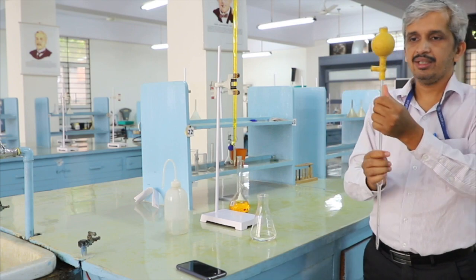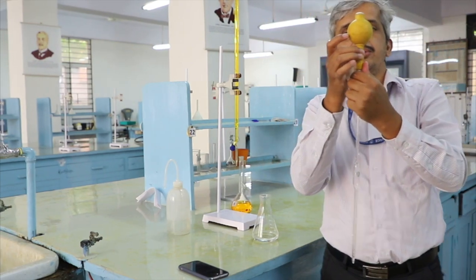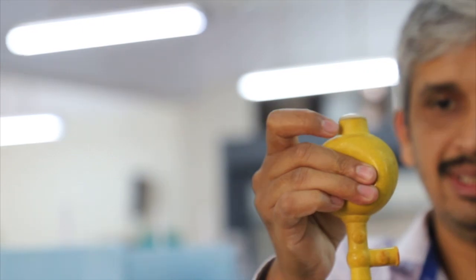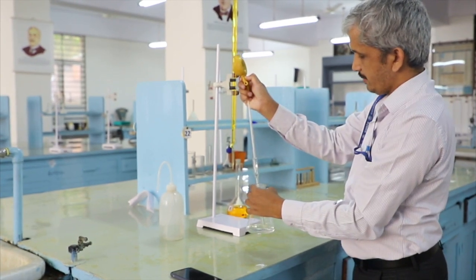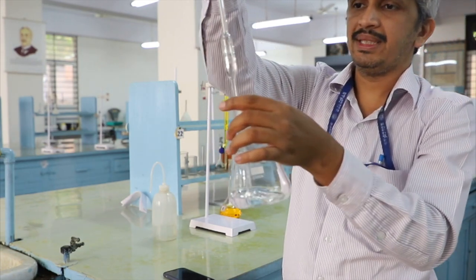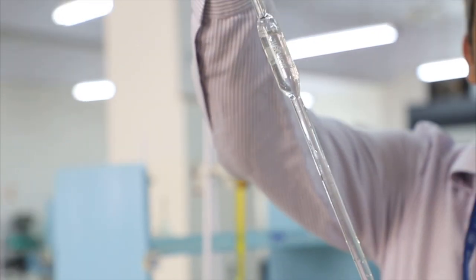or pipette filler, I am going to wash this. So here, if you see the pipette bulb, this is used to fill the pipette. So how to perform this? Just press this region and immerse in the solution to be taken, in this case distilled water. And if you release this region here, then there is a suction and it will fill the pipette. You can see the water level in the pipette is increasing. So since I am just rinsing, I will stop at this stage.